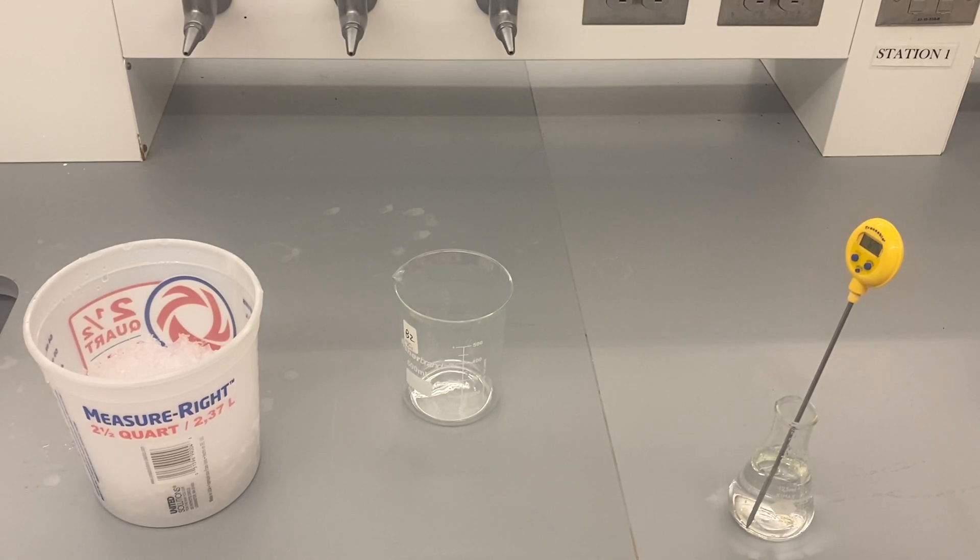Hey gang, it's Victor here with another Chemistry Laboratory Fundamentals video. Today we're just going to be looking at a simple ice bath. We've done heating plates and Bunsen burners before, now we're going to go the opposite direction and take a look at how you might cool things off.